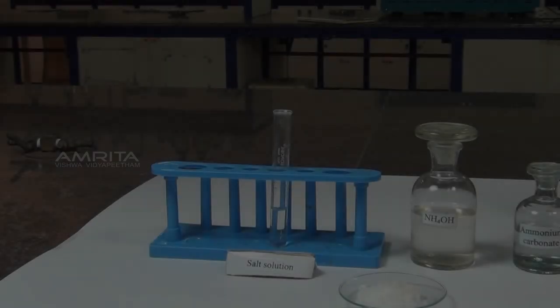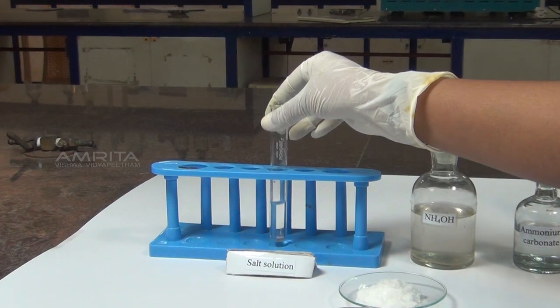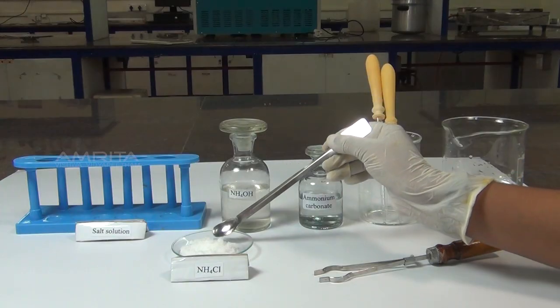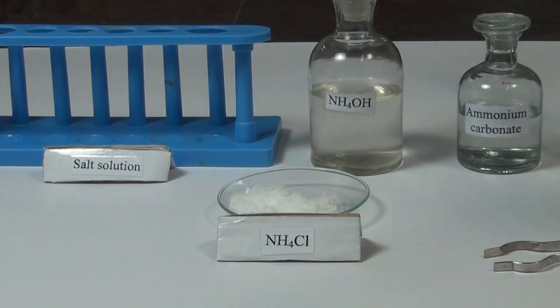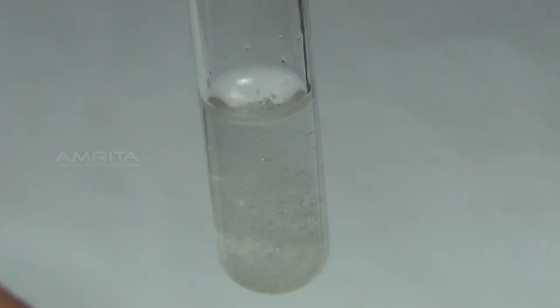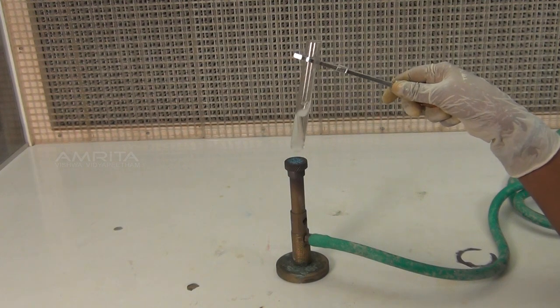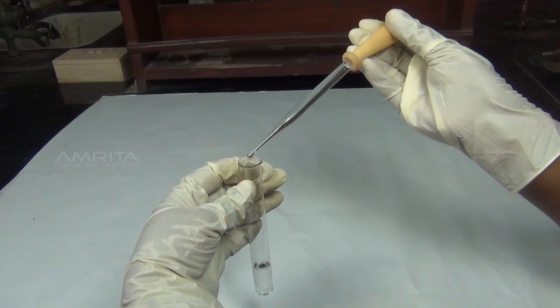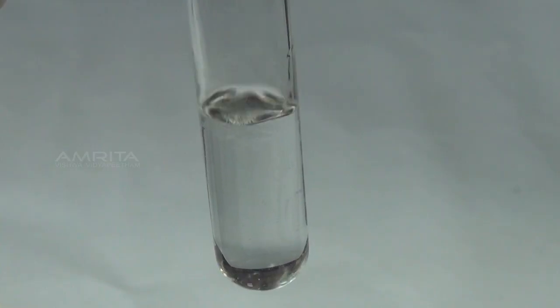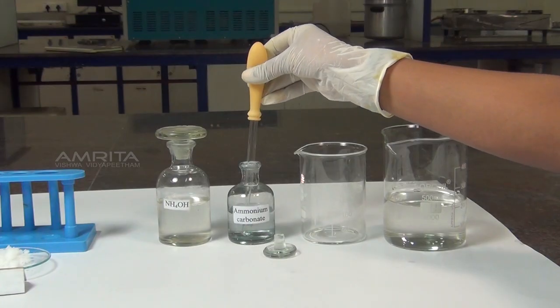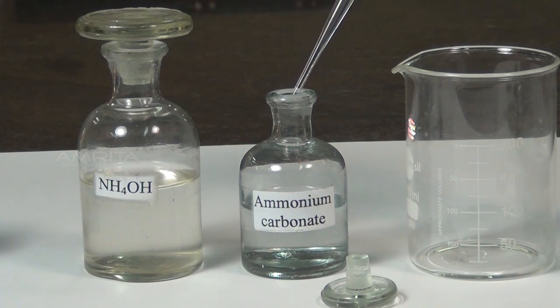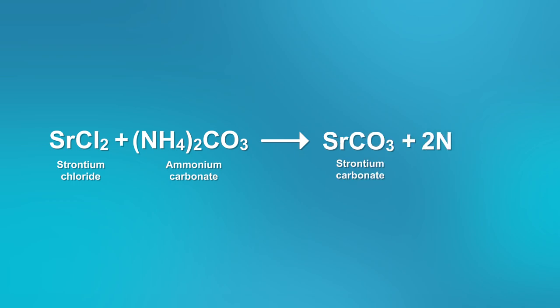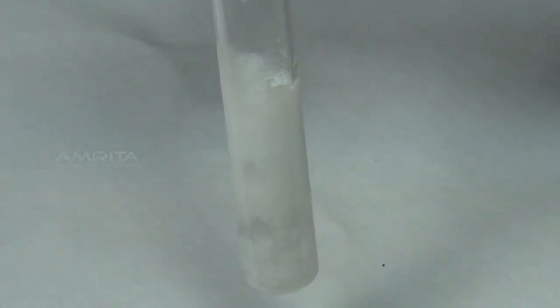Procedure: take a small quantity of salt solution in a test tube. To this, add a small amount of ammonium chloride using a spatula. Heat the test tube over the Bunsen burner and cool. Using a dropper, add ammonium hydroxide to the test tube till the solution smells of ammonia. To this, add ammonium carbonate solution using another dropper. Strontium ions in the solution react with ammonium carbonate to form a white precipitate of strontium carbonate.